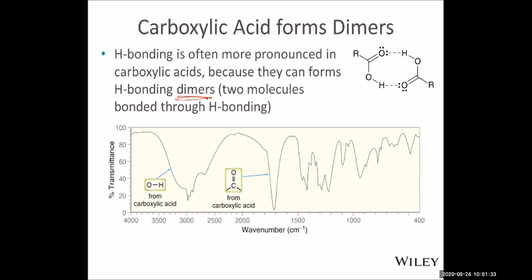So that's how, given an organic molecule, based on the absorption frequencies and our knowledge, we can predict what kind of frequency there should be absorption. And by comparing with the real infrared spectra, we can tell if the molecule given is this molecule or not.